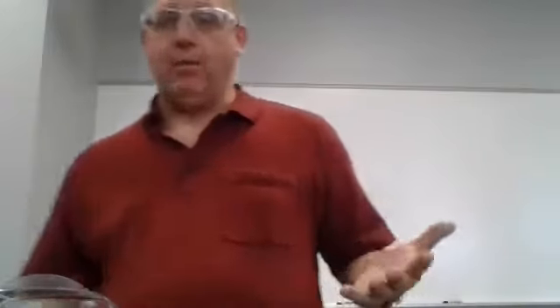Well, welcome to the lab on atomic absorption spectroscopy. You will find that lab in your general chemistry lab manual under atomic absorption spectroscopy. I expect you to be able to read that on your own, but I'm going to go ahead and go through the procedure that we have here.